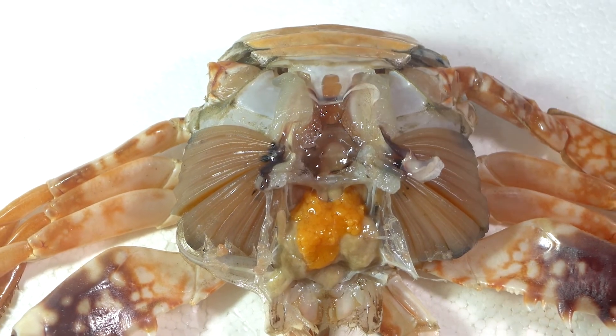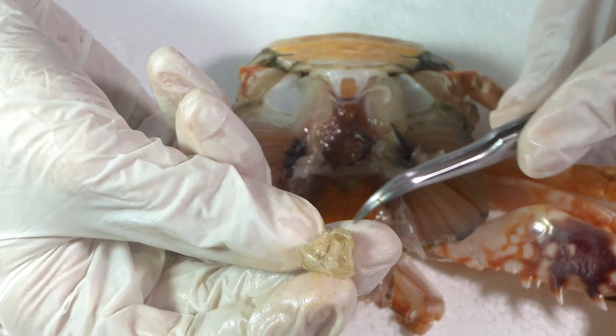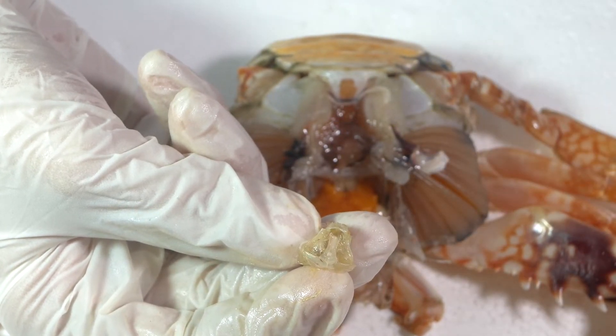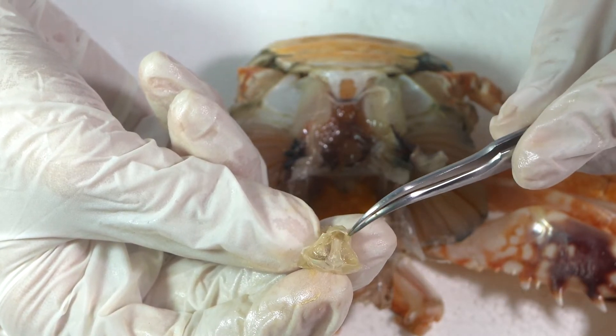We have exposed the stomach. The stomach is a large organ with muscles attached to it. These muscles allow the stomach to push and pull. Inside the stomach is a structure called the gastric mill that crabs use to provide additional chewing or grinding to what the mandibles did.